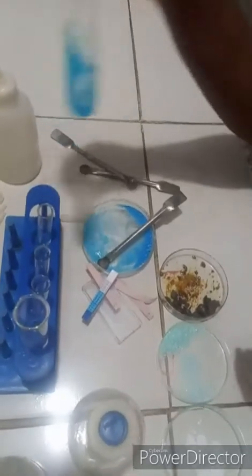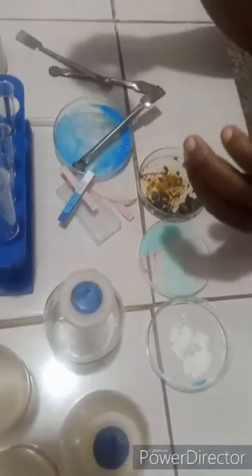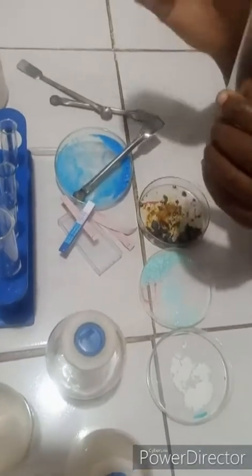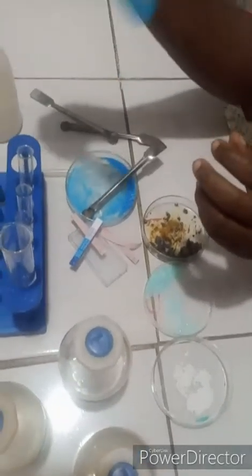How do you report this? You report it as your test, observation, and inference. You draw your table. The test is, you write, test number 1: 1 spatula full of sample A plus 10 cm cubed of water, as you can see in the result table. And record your observation: sample A dissolved completely in water to give a blue solution.